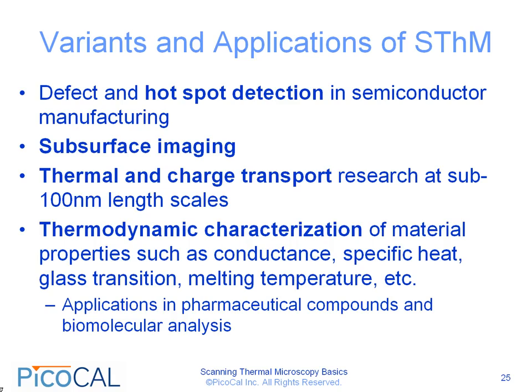From a purely research standpoint, SThM can be used to study thermal and charge transport at sub-100 nanometer length scales. And from a pharmaceutical and biotechnology standpoint, SThM is very useful in the thermodynamic characterization of material properties such as conductance, specific heat, glass transition, and melting temperature. These types of measurements, if they can be done with very high spatial resolution, are of immense importance to material scientists, pharmaceutical compound development, and biomolecular analysis.